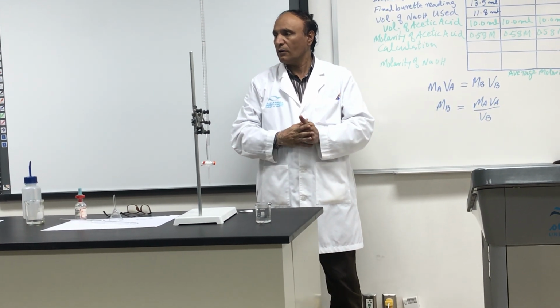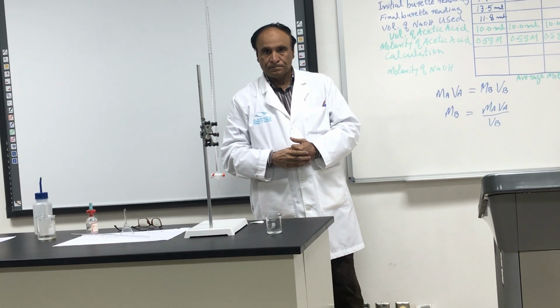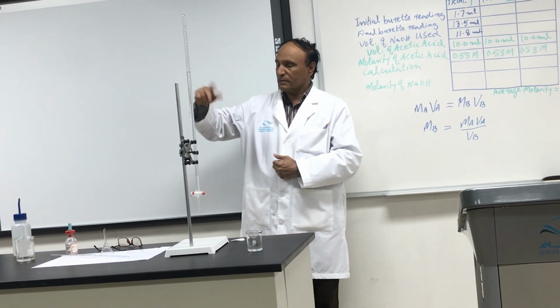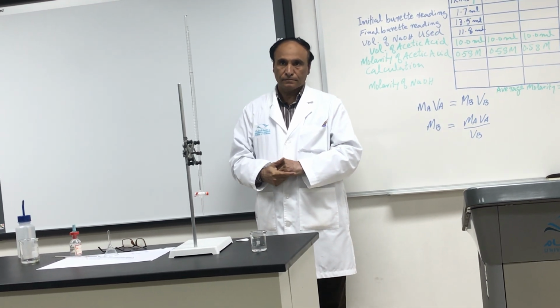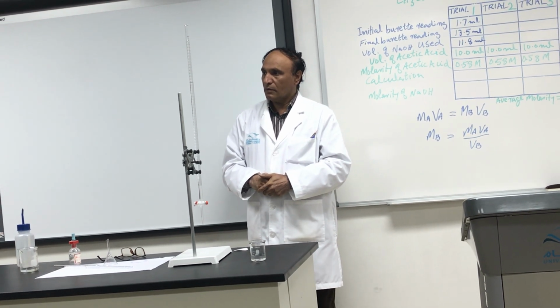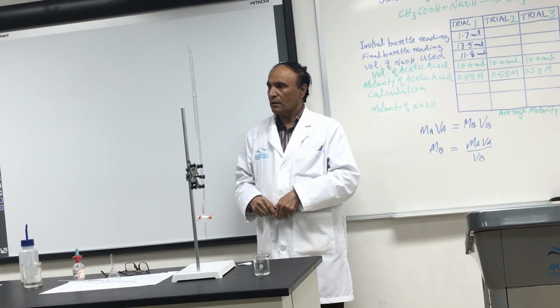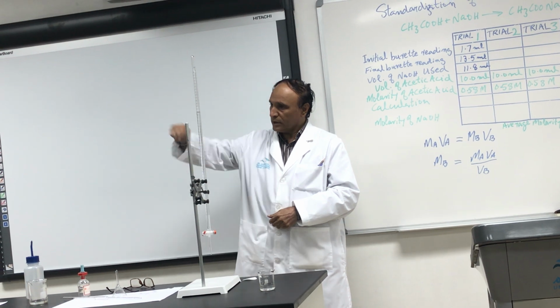Wash 2-3 times. Wash more. One time more. Throw it now.